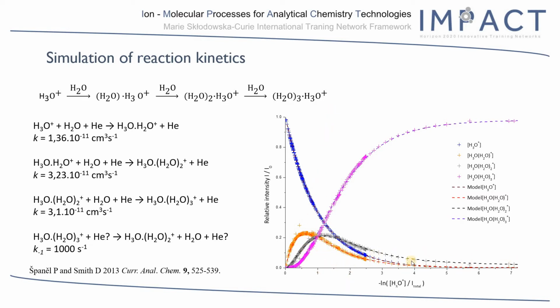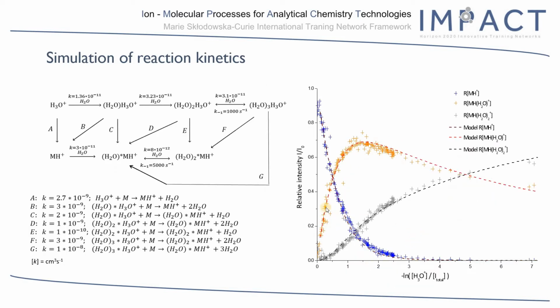the observed experimental results. In the next one, I simulated a similar but more complex problem, where we also injected acetone vapors into the system. As we can see, the reaction schema is more complex than the previous one. However, we were still able to simulate the experimental results.